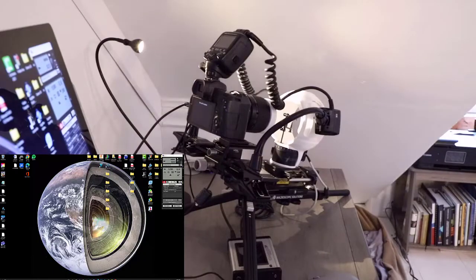Alright, I'm Mark with Macroscopic Solutions, and what I'm going to start doing is recording all of the samples that I'm going to be imaging, whether that be for our own internal purposes, whether our clients are sending us materials where they need high-resolution images of them, or if it's to do demos for specific departments within universities. So the idea here is we're going to get a mixture of a large variety of different materials that are going to be typically challenging or difficult to capture images of using regular microscopes or even sophisticated digital imaging solutions.